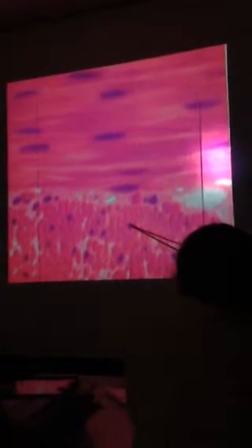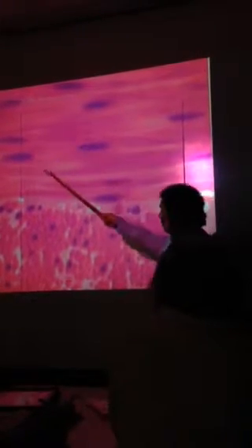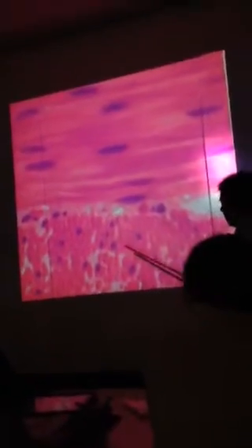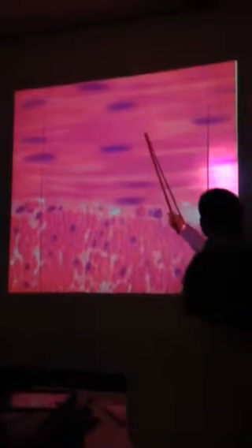This is smooth muscle cut in cross-section. Smooth muscle longitudinal section. You see the nuclei, obviously, right? So you can imagine these being spindle-shaped cells. And notice here, the nuclei are located in the center of the cell, right? You'll say, why don't all of them have nuclei? Because, again, if you cut right through here, you're not going to hit a single nucleus. If you cut through here, you're going to hit one, possibly two nuclei. That's why you only see nuclei scattered throughout. Does that make sense?